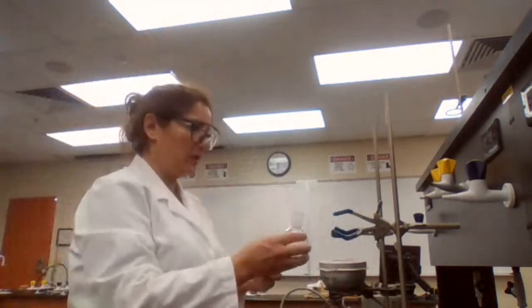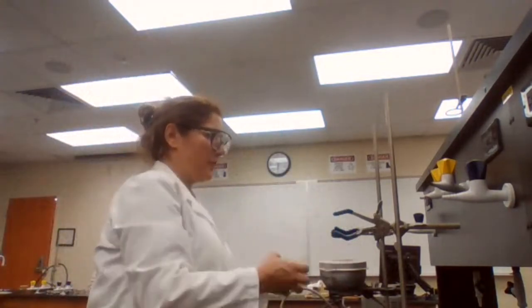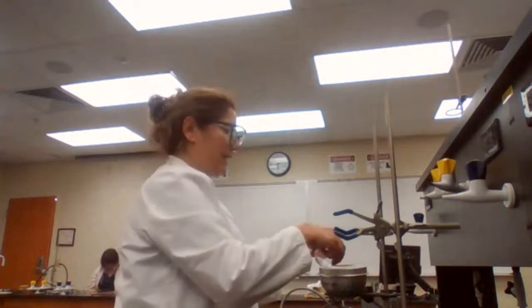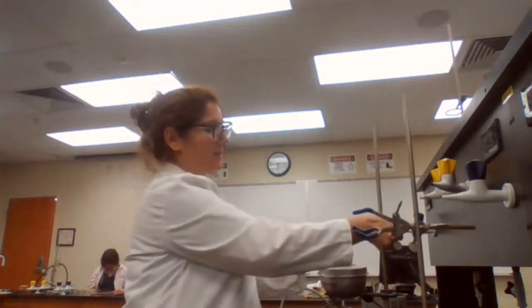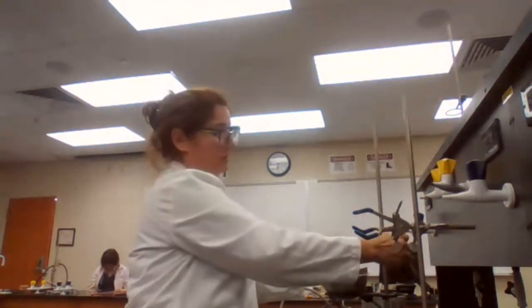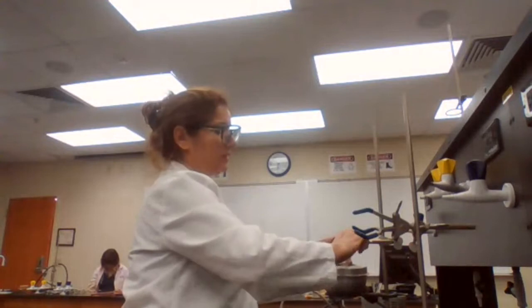Okay. So we are going to follow the glassware from hot to cold. That means from the side of the heating mantle, we are going to start assembling the glassware. First is the boiling flask. We are going to hold the boiling flask, or secure it, using a utility clamp.